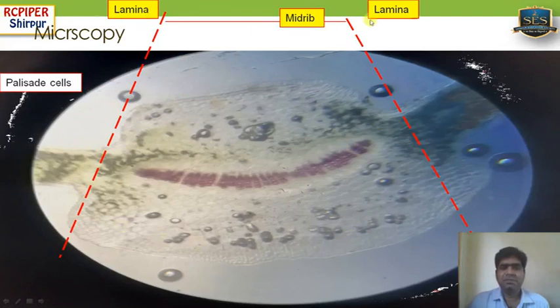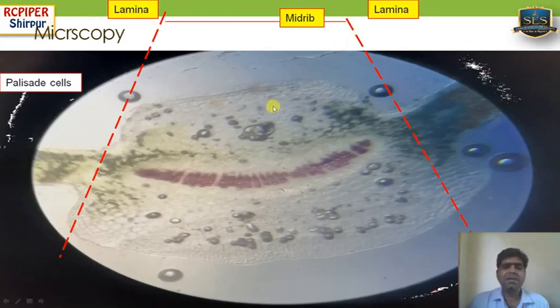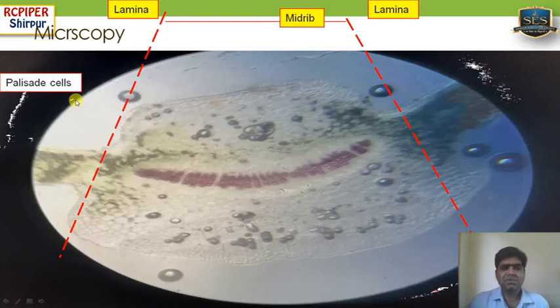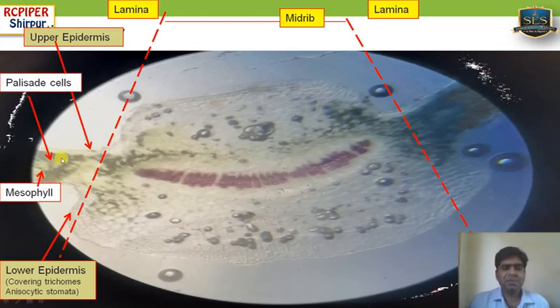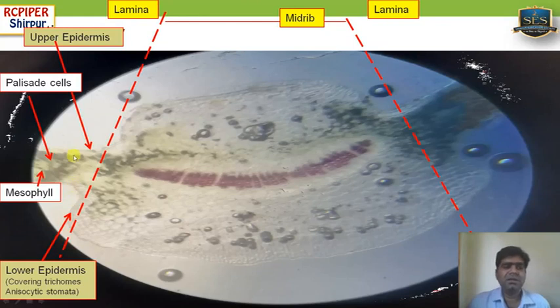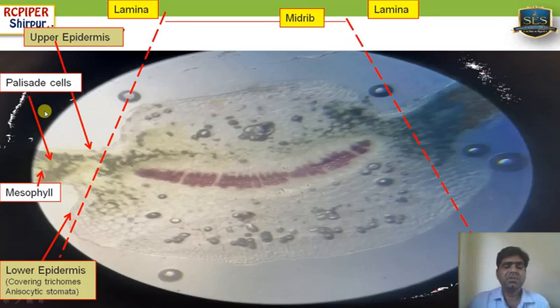This is the actual TS of the Vinca leaf. This leaf can be divided into two parts: the lamina part (indicated by a dotted line) and at the center, the midrib part. The lamina part, as already discussed in the general TS, shows similar characteristics — upper epidermis, lower epidermis, palisade cells, and mesophyll. When palisade cells are present only on the upper side, it is known as a dorsiventral type of leaf. When palisade cells are also present above the lower epidermis, it is known as an isobilateral leaf. Vinca shows palisade cells just below the upper epidermis but absence above the lower epidermis — so it is a dorsiventral type of leaf.